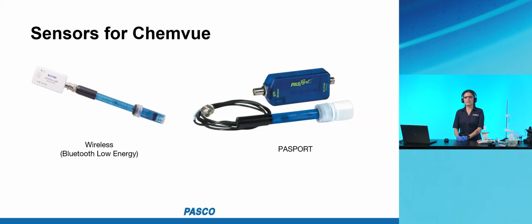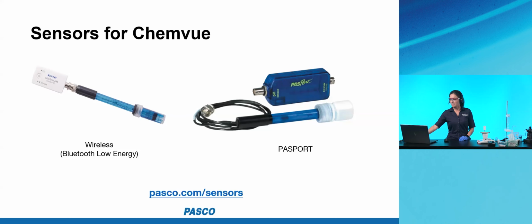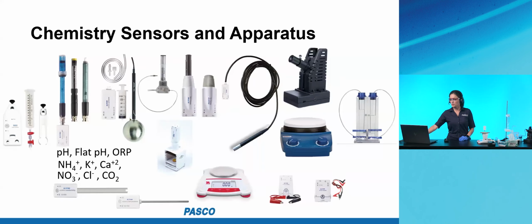Yeah, and I will also highlight the types of deeper analysis and error analysis that will be available in Chemvue, which is why you're wondering, well, why would I want the licensed product if I have SparkView? I'll show you, and you can see the extra things you can do with the Chemvue product. Okay, so I'm going to show you another slide.